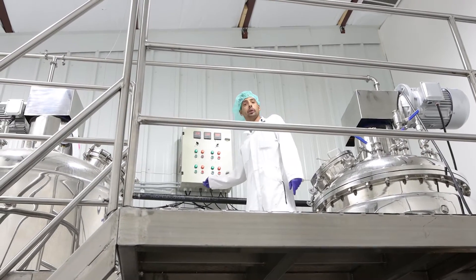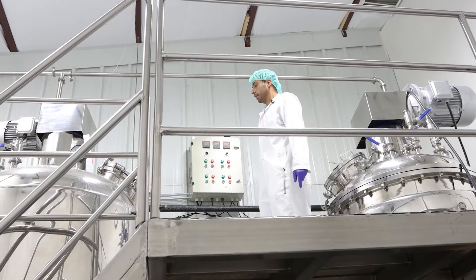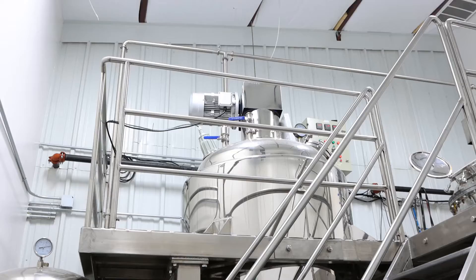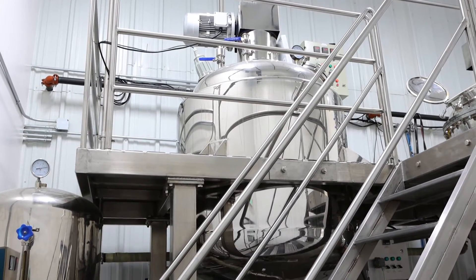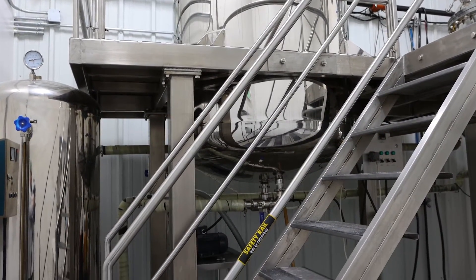Here are our vacuum control switches, which vacuum all the air out of it — essentially deaerating it. Right here is some gel. You can also mix medicine in this tank; it's roughly the same size. We use it to mix any kind of medicine that we use.